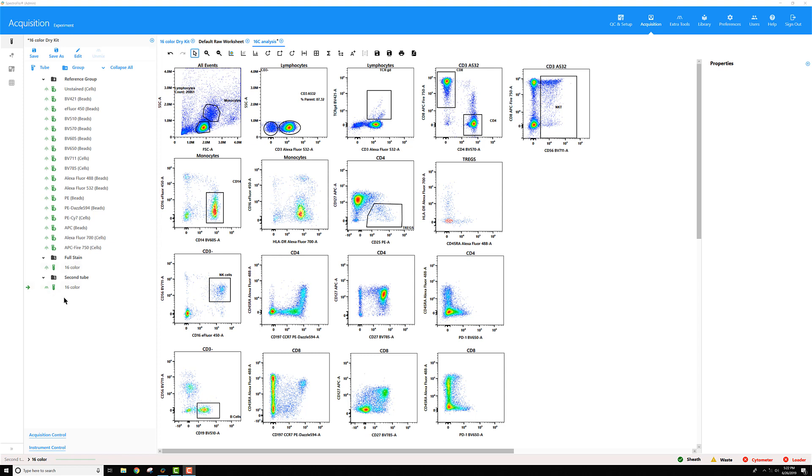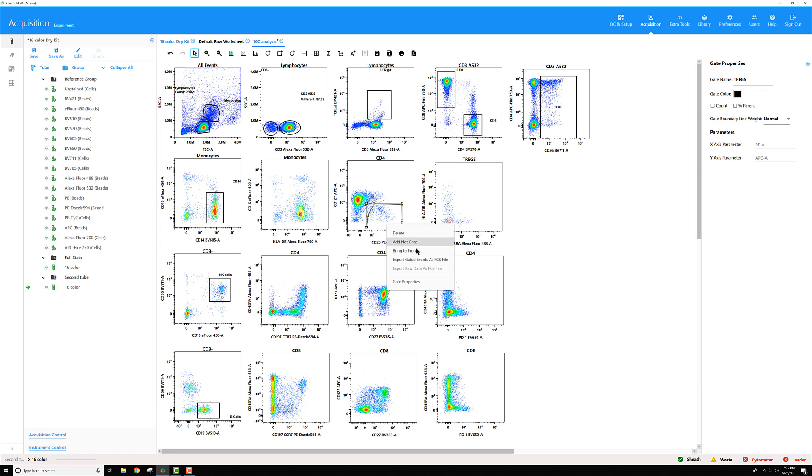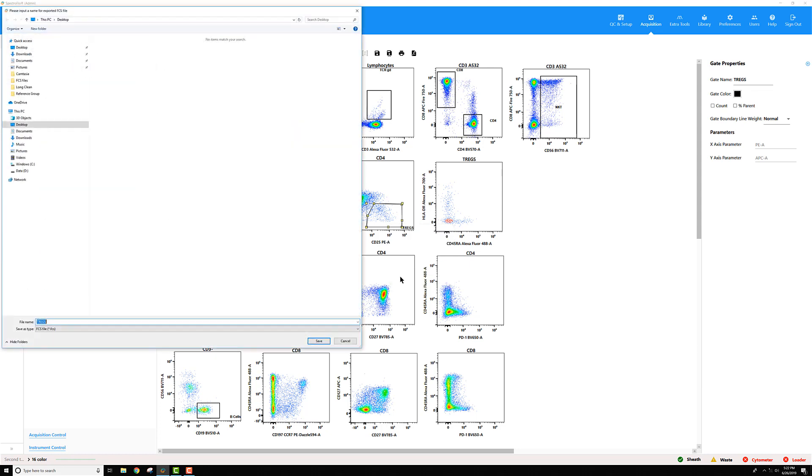To do that, I'll show you here using this multi-color tube. I'm going to select one of my gates, perhaps this TREG gate, and I right-click on it, go down to Export Gated Events as FCS File, give the file a name and choose where you'd like to save it. I will place this one on the desktop, then click Save.